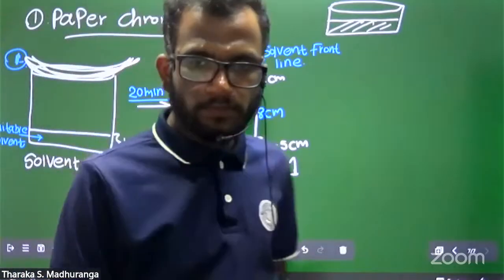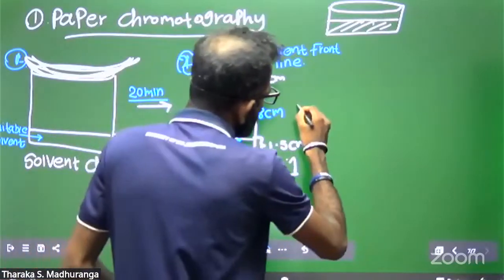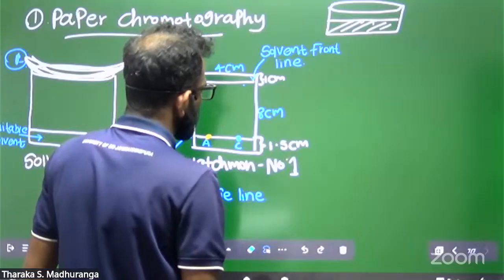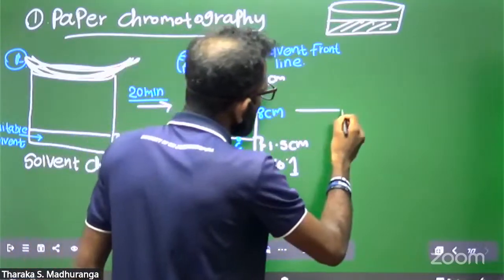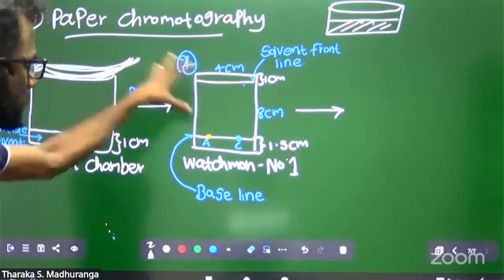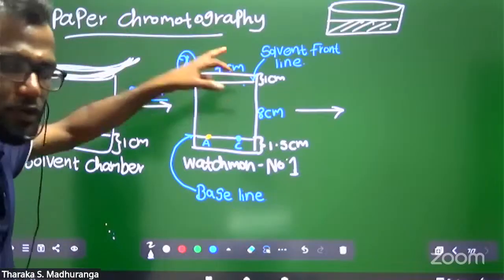Okay. Now, the second step is okay, we have prepared the chromatography paper.